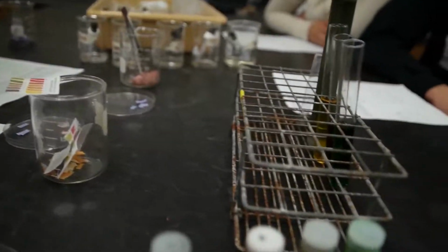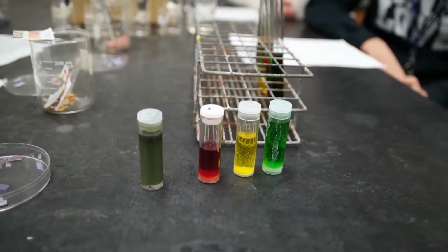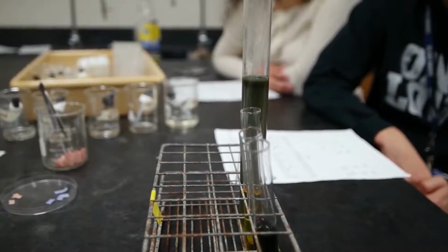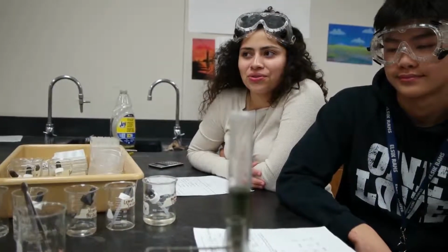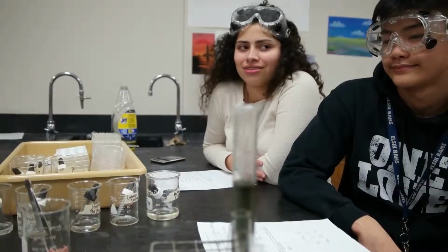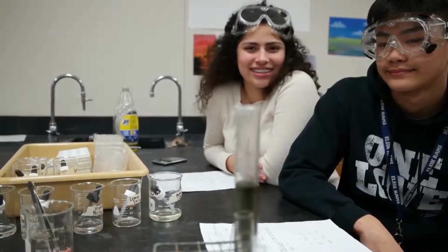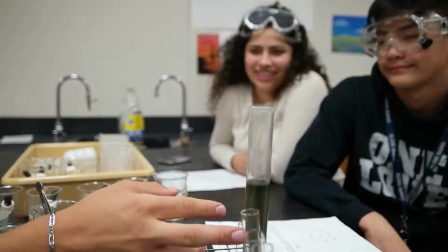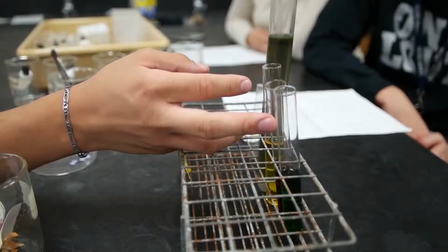So these are the tubes. Why do you use a larger tube for this? Because that's what's coming out the most from the dog. Since it's a larger amount, it's easier to find out from that substance. That's the size of the sample he gave. This is feces, this is blood, this is urine, and this is vomit.